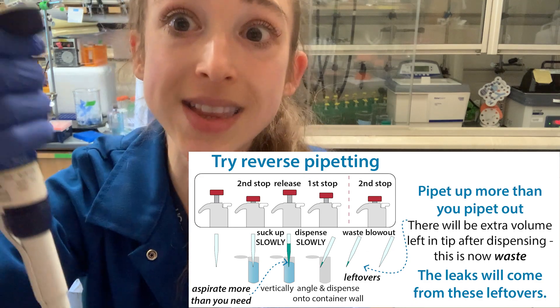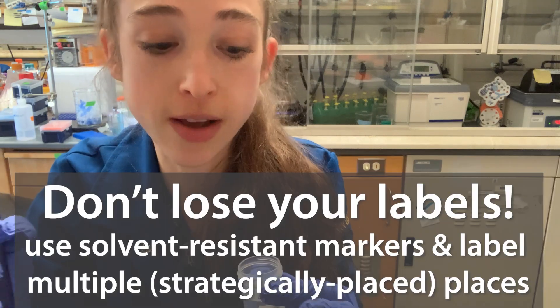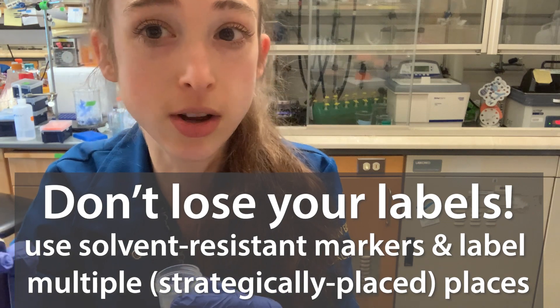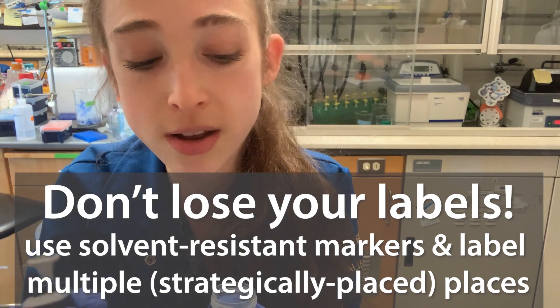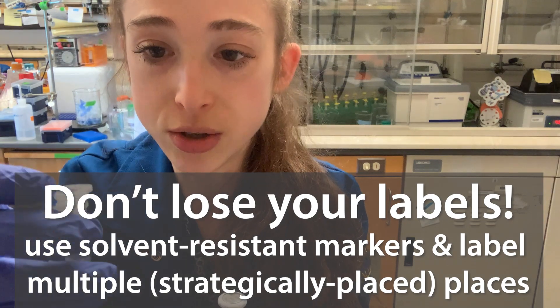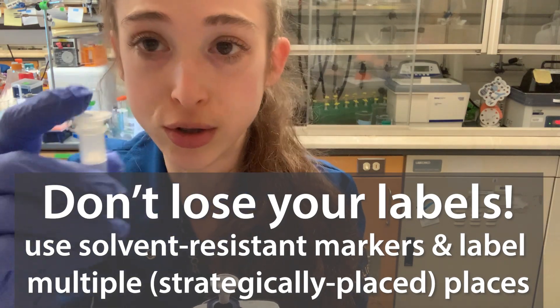You're still going to get that leaking onto your tubes potentially, so that could be an issue. You want to make sure that whenever you're working with ethanol, you're using solvent-resistant markers if possible. I like to mark things in multiple places on the tube in case one comes off. If you're doing a micro spin column, be careful that ethanol with marker ink up top doesn't get into your sample tube.